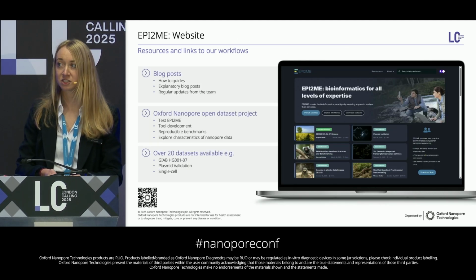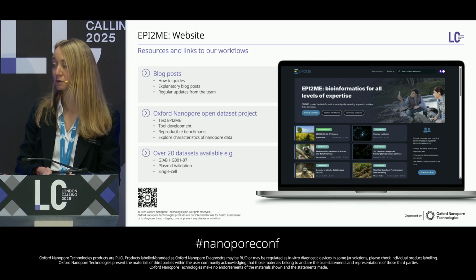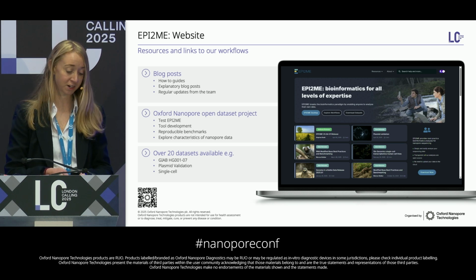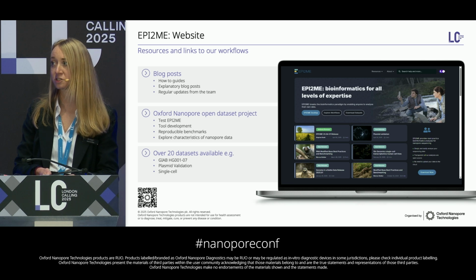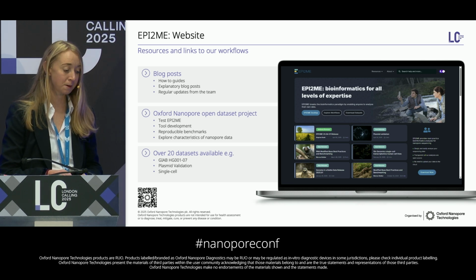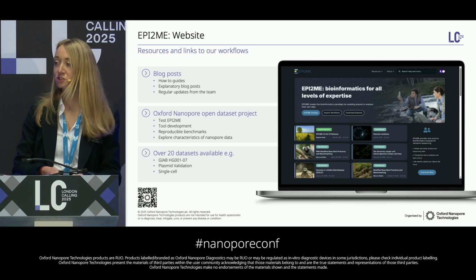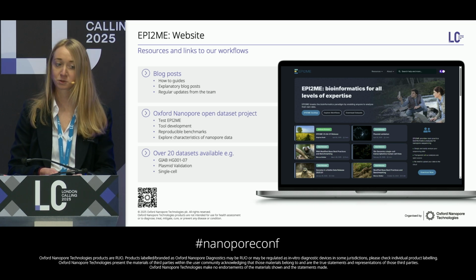Finally, I wanted to mention the EPI2ME website, as it's a really great resource with lots of explanatory blog posts and how-to articles, as well as regular updates from the EPI2ME team. There you'll also be able to find some more comprehensive datasets that are part of the ONT Open Dataset project. These can be used for lots of things, such as developing your own tools, exploring characteristics of nanopore sequencing data, and reproducing or looking into our benchmarks.